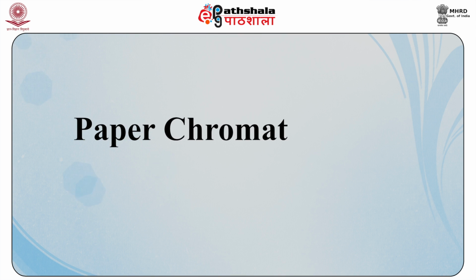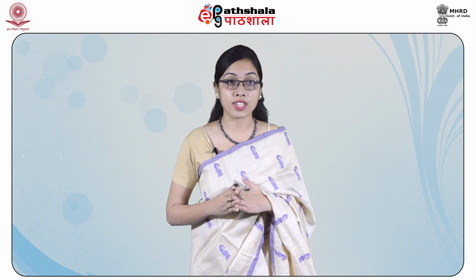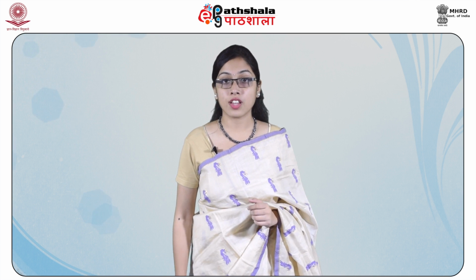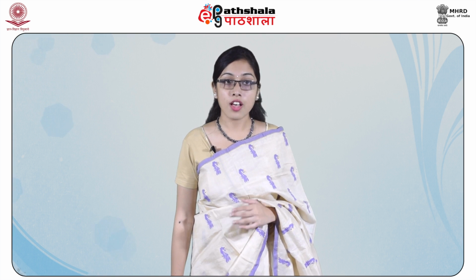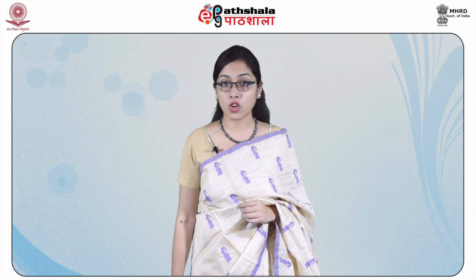Next, we will be studying about paper chromatography. In paper chromatography, substances are distributed between the paper as a stationary phase and a suitable mobile phase. The chromatography paper has highly uniform texture and thickness. It is made from cotton cellulose and has low content of additives. For the separation of the mixture, a discrete spot is applied on the paper.